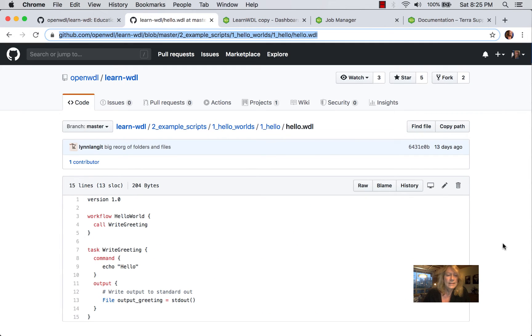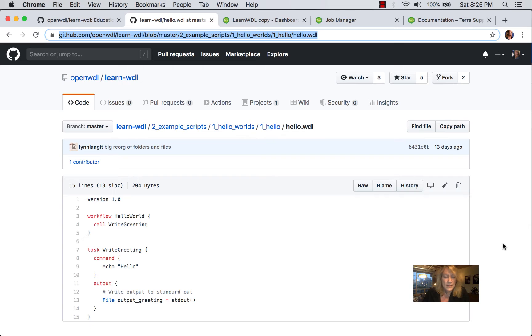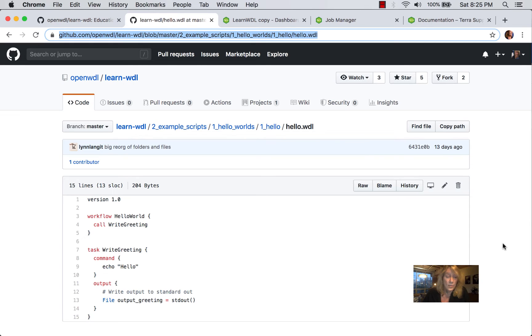So you can see in 15 lines of code here in the first Hello World example, we have the key parts of the WDL scripting language. In lines 3 through 5, we have the workflow definition, which is just Hello World, and it simply calls the one defined task, which is Write Greeting.